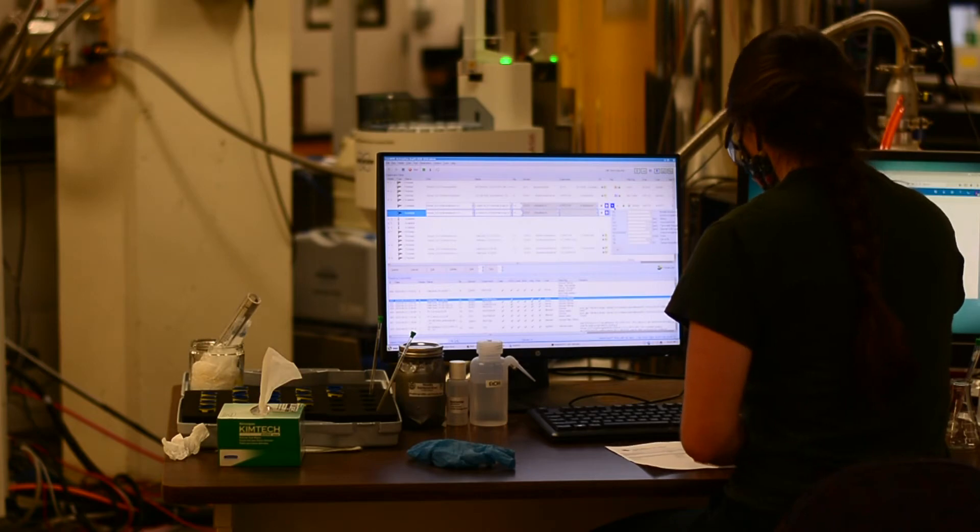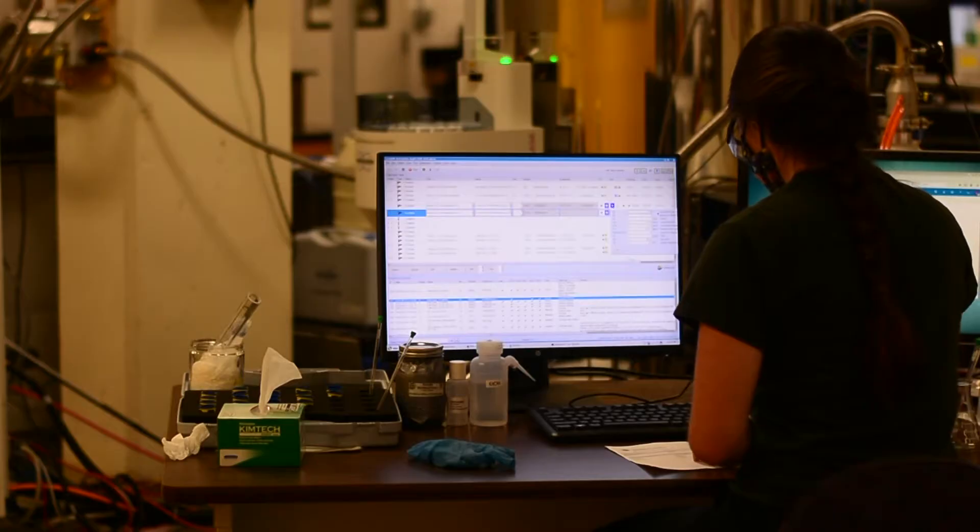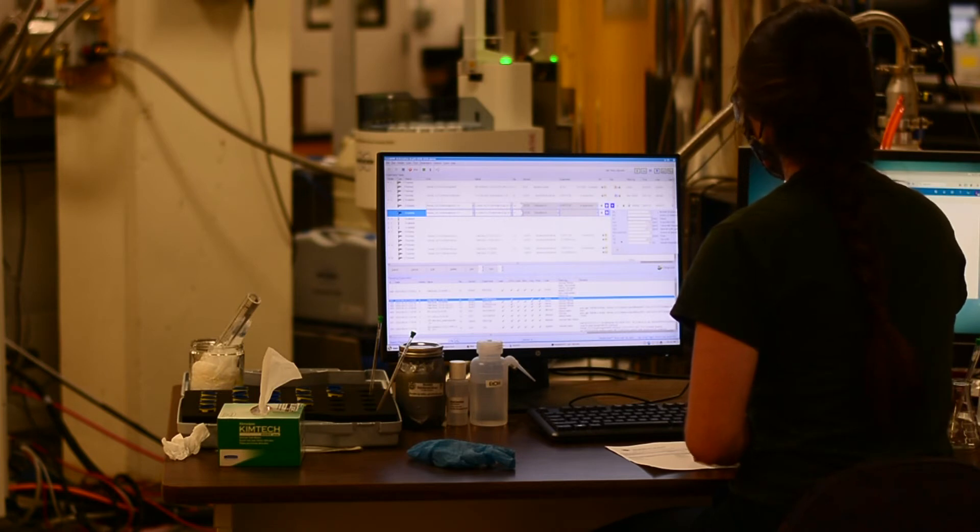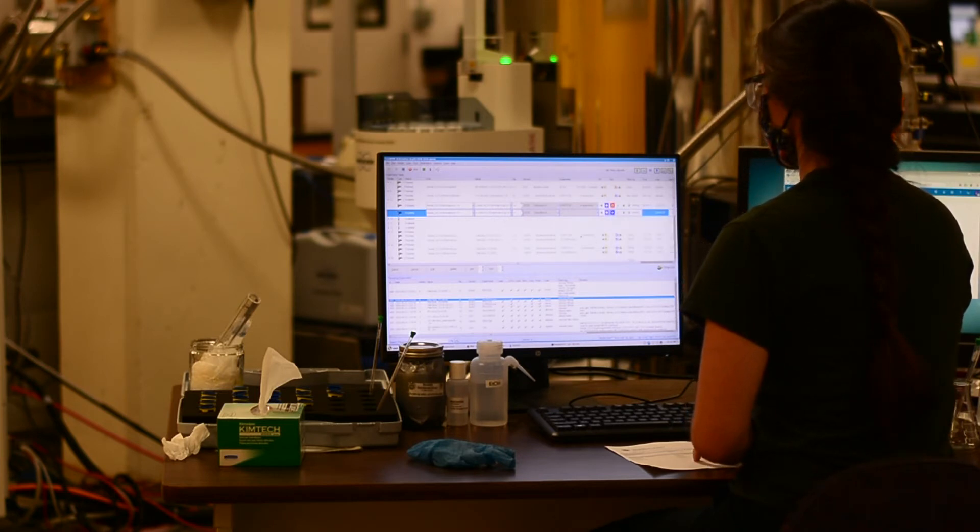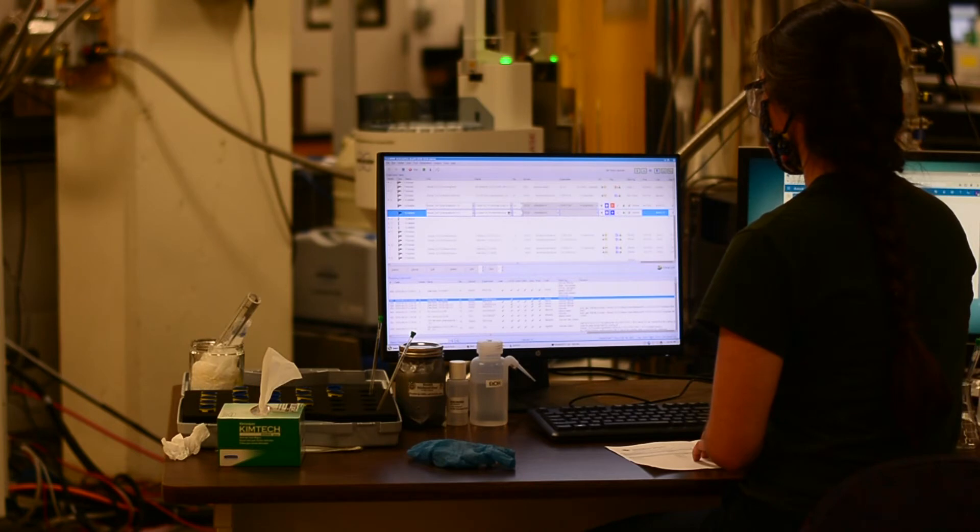You can change default parameters by clicking on the equal sign, such as the number of scans or dummy scans for your experiment and more advanced parameters as well. When you change the default parameters you'll notice a red box with a yellow exclamation point and that just means you've altered the parameters from default.